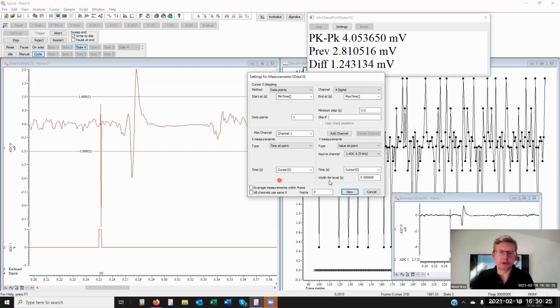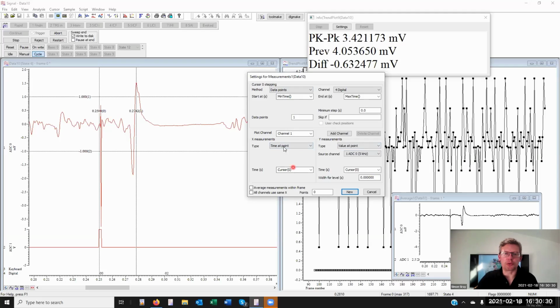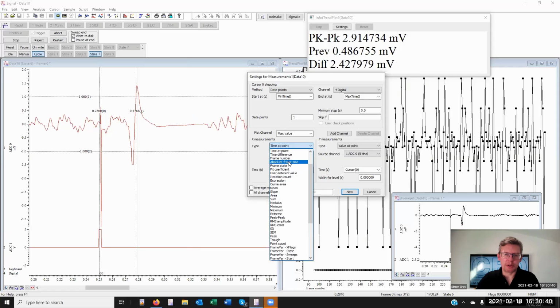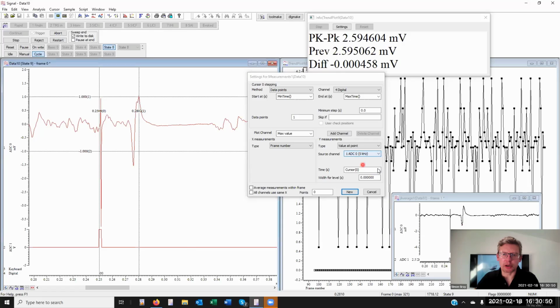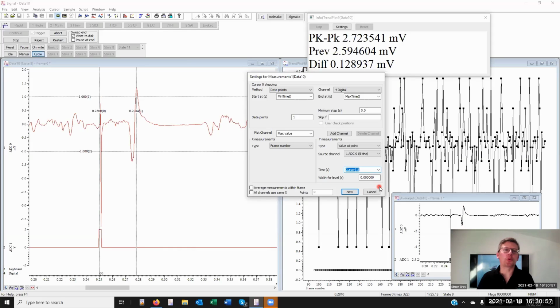And then we come down to what you should already recognize as the trend plot controls. Let's say this is max value as a name, and we're going to plot the frame number versus the value at point. And that value at point is going to be measured on channel 1, and it is the position of cursor 1. Whereas cursor 1 locates the feature, the peak, then it'll report its amplitude to this XY view.